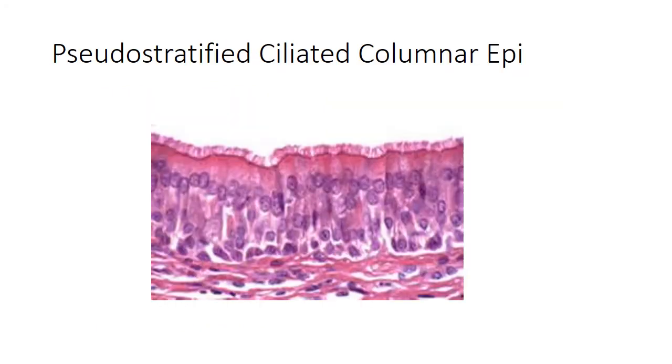Then we go to this one, pseudostratified ciliated columnar epithelium. Sounds like a mouthful, doesn't it? All right, well, what do you got on top? See this? Looks like shag carpeting. So that is the cilia. You'll find these, for instance, in the tracheobronchial tree, in your upper airway. Also, here's the nuclei. Now, the thing is, guys, if you push on these, they look all smushed together.